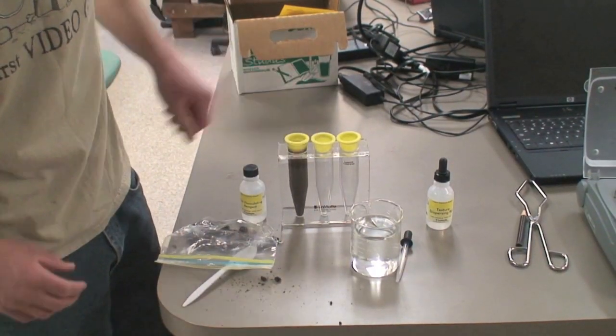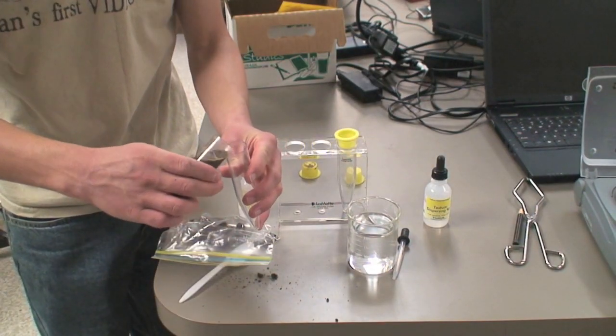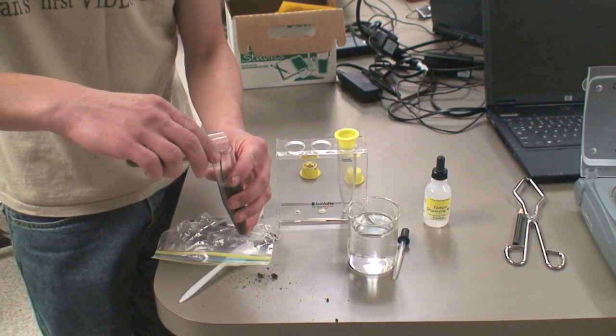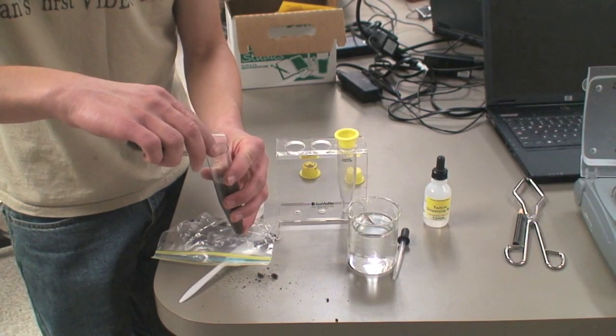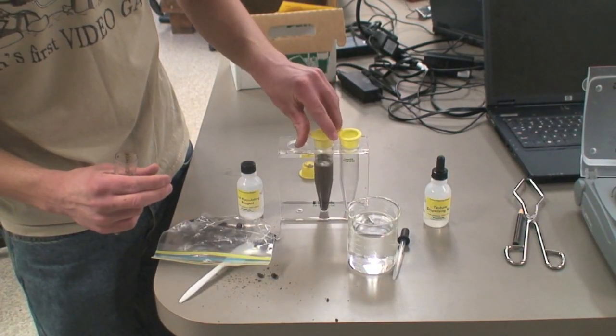Put the tube into the rack and let it sit for 30 seconds. Now pour the solution from the first tube into another tube. Put them both into the rack and let them sit for a half hour.